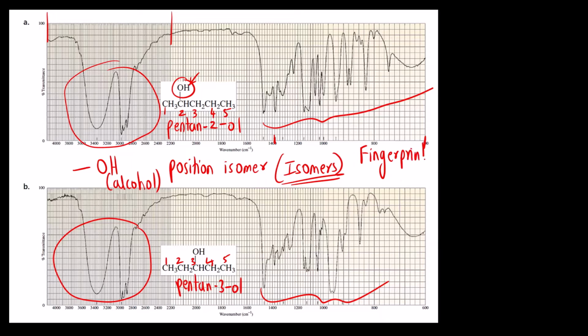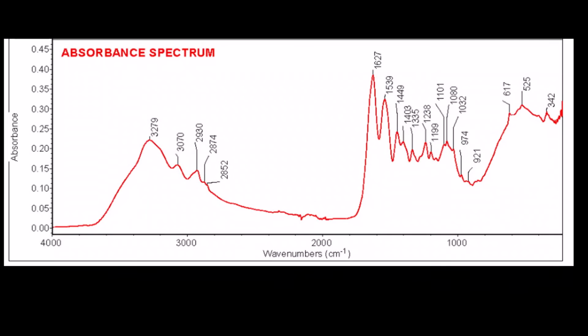So in this way, for any two different compounds that you take, the fingerprint region is going to be completely different, even though the functional group region can be the same because the functional group is the same. Now the question is, why were the peaks that we saw in the previous slide inverted? But what we are studying is the absorption, right? If you see the absorbance spectrum, it is something like this. Peaks are straight like this. That is the maxima, and this represents the absorbance.